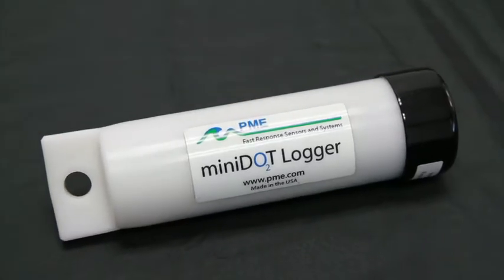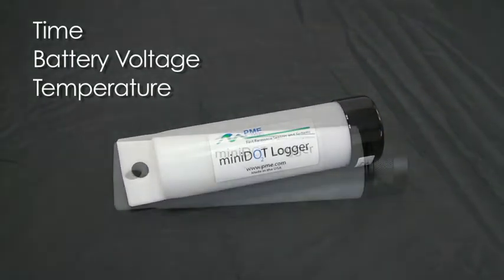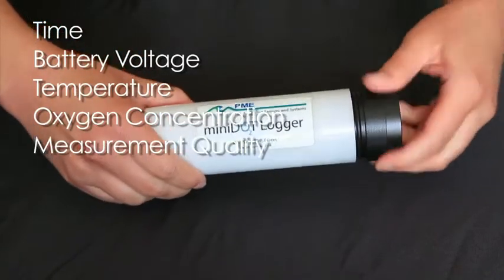Every logger is shipped ready to go. It is set to measure and record time, battery voltage, temperature, oxygen concentration, and quality every 10 minutes.